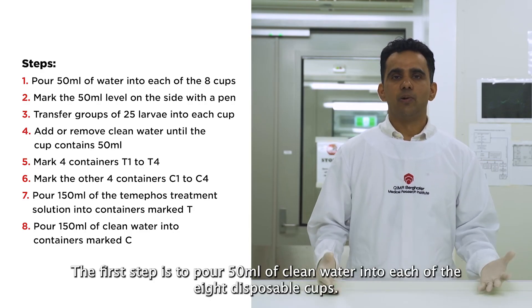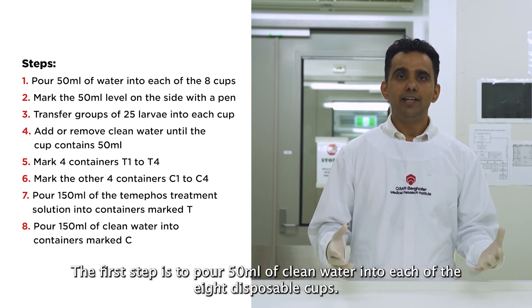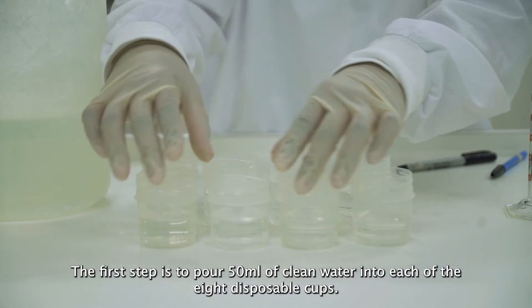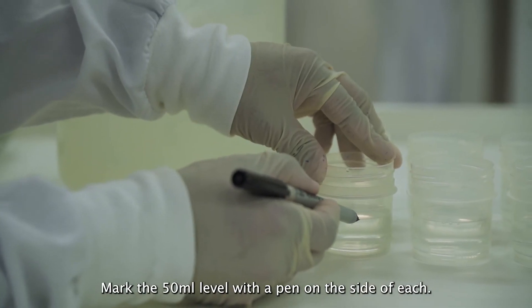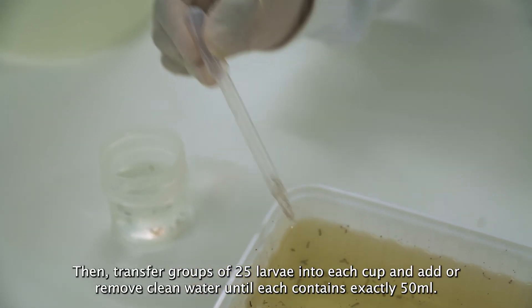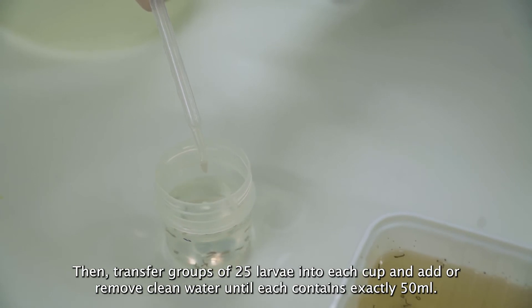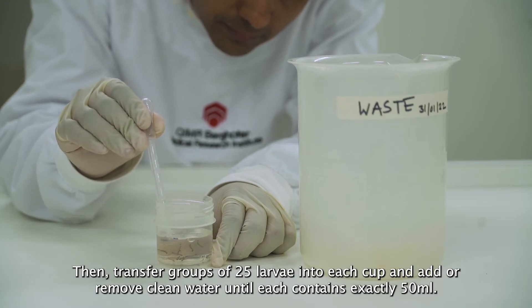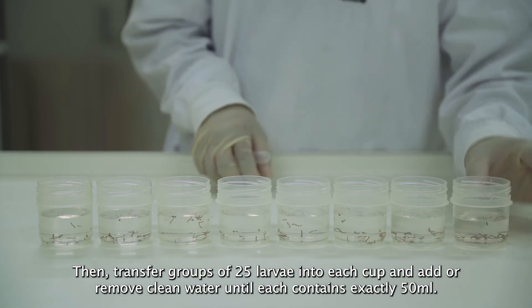The first step is to pour 50 ml of clean water into each of the eight disposable cups. Mark the 50 ml level with a pen on the side of each. Then transfer groups of 25 larvae into each cup and add or remove clean water until each contains exactly 50 ml.